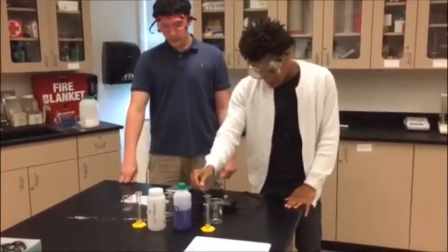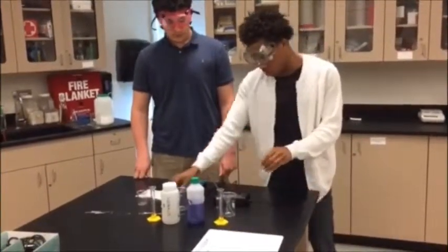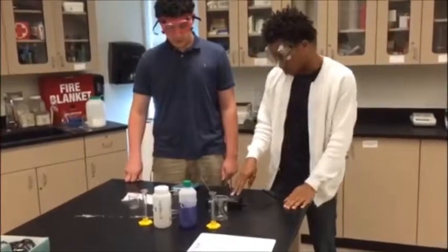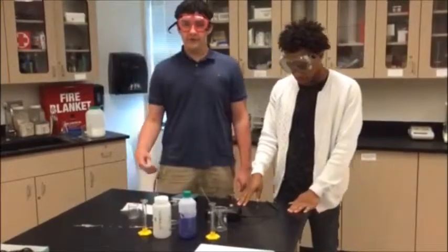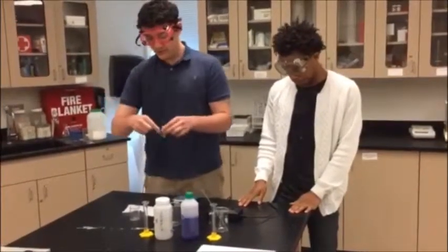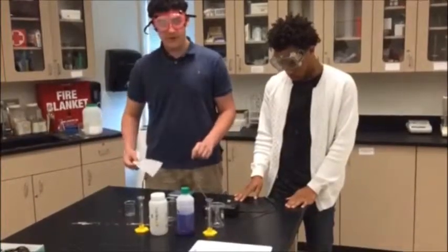So the first thing that we're going to do is turn on the spectrometer. The SpectroVis is attached, and we're going to use the cuvette, making sure we wipe all the cuvettes with the Chemwipes and put them in correctly so that they absorb the light from the wavelengths. We're going to do a blank so we can get the warm up so that we have the correct wavelengths. After we have done the blank test and calibrated, we would take this out, fill a cuvette with just the crystal violet solution, and measure the peak absorbance value so that we could get the right absorbance testing value. Wipe it, place it, and then record that value.